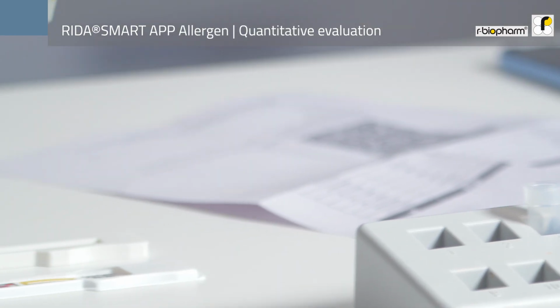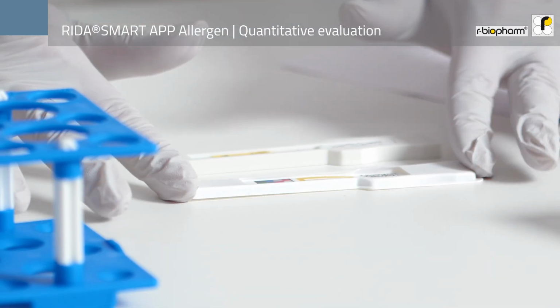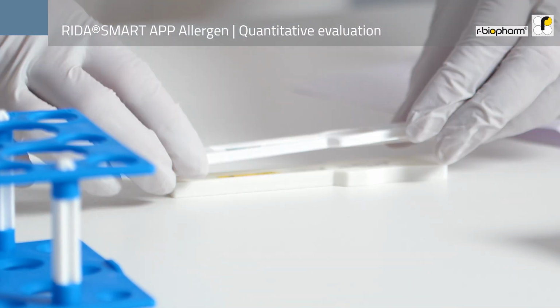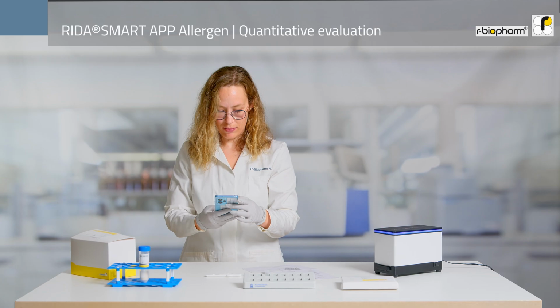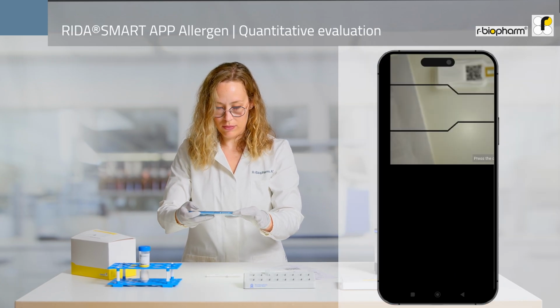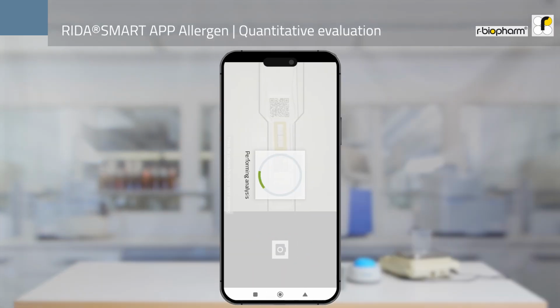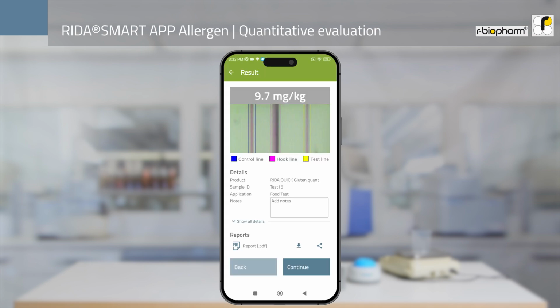For evaluation with the RIDA SMART App Allergen in combination with a verified smartphone, cover the test strip and test strip holder with the RIDA Smart App cover of the RIDA Quick Quant Evaluation Kit and start the measurement. A live camera image appears on the smartphone display with a frame. Position the smartphone above the RIDA Smart App cover so that the frame aligns with the cover. Tap the camera icon to take a photo of the test strip. The RIDA SMART App Allergen then performs the evaluation.